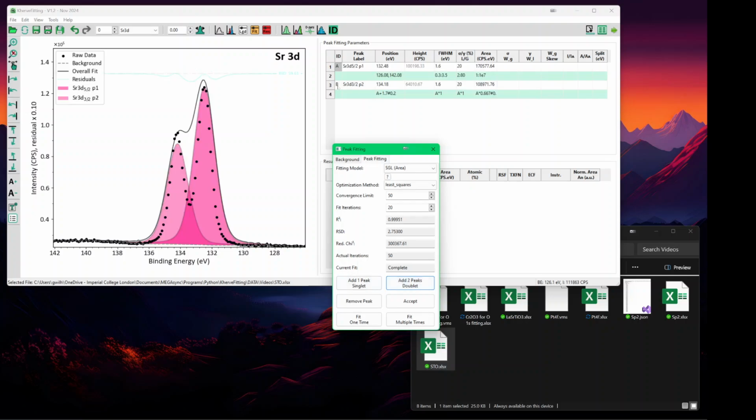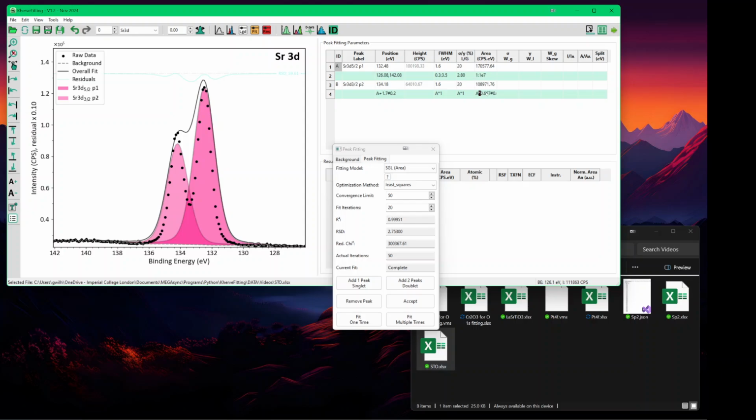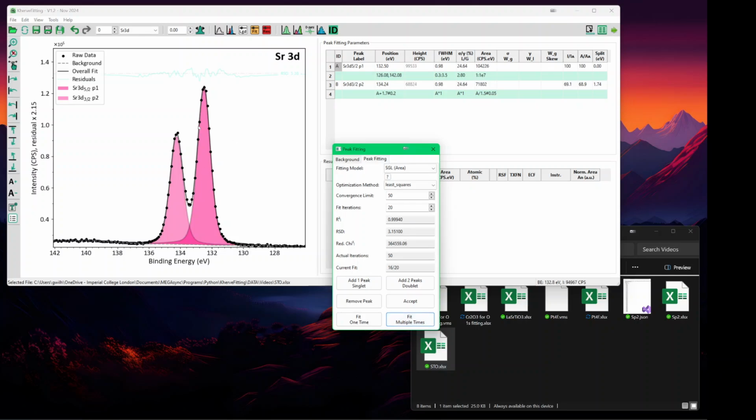So they are both, peak B is in function of peak A. The width is the same as peak A, and the area is also times 0.667. So you can decide to call it 0.667. We can divide by 1.5 also. And here I like to leave a plus minus 0.05, so that gives a little bit of variation. Okay, so let's see now. So that will be exactly the same as before. And now we see it fits.